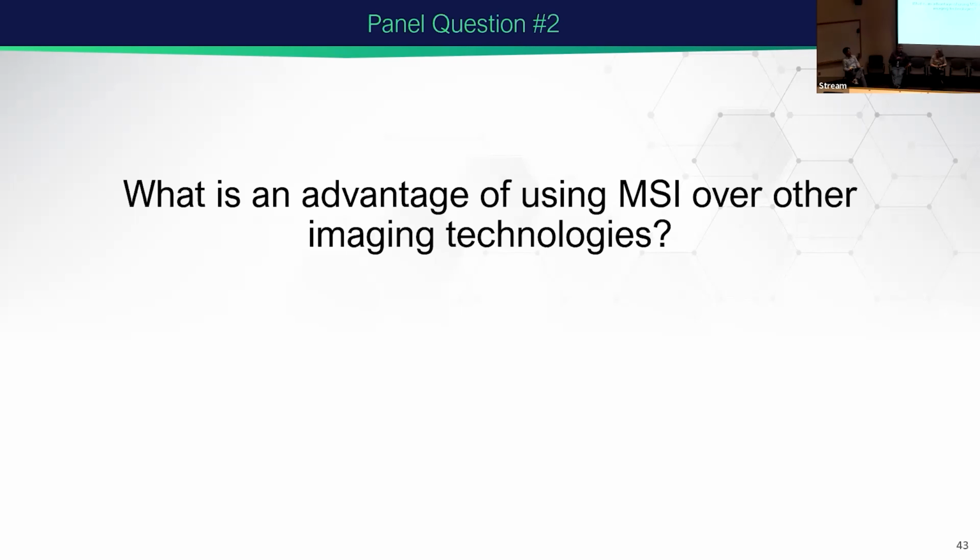One thing that I've seen recently, and this is hopefully going to go out for review in a month or so, is somebody put carbon-13 labeled glucose into a soil, came back a year later, and there's still carbon-13 there. That kind of surprised me. But what was really cool, and this is something that NanoSIMS showed us, is that the carbon-13 that was labeled was correlated to nitrogen.